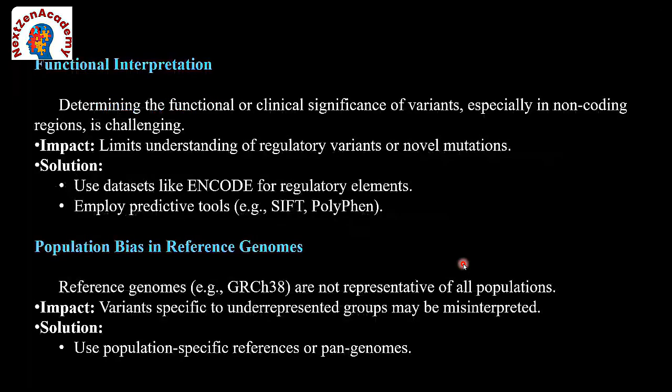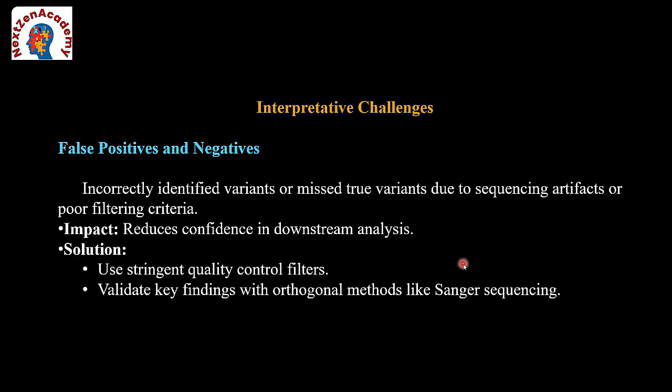In computational issues, the challenges are complex workflows and standard tools like GATK and Docker. Another thing is incomplete databases: when we are doing annotation, the publicly available databases might not be up to date. In that condition, we must identify the novel variants ourselves.